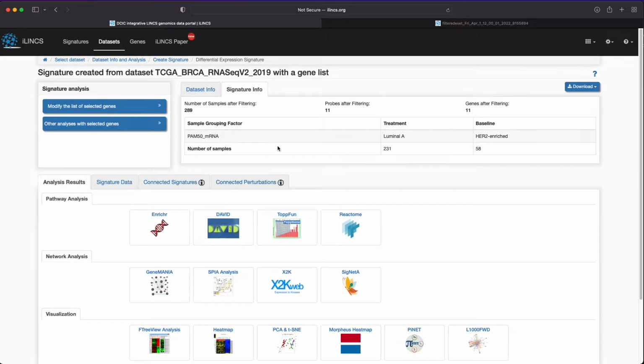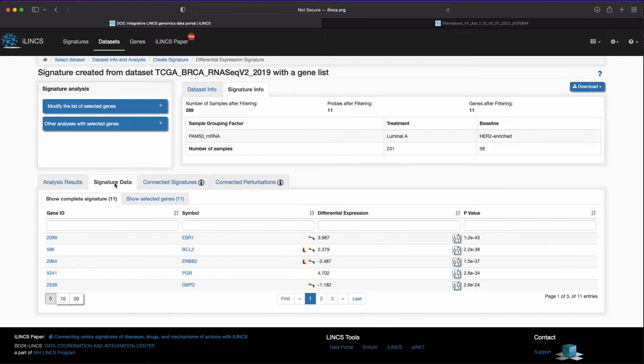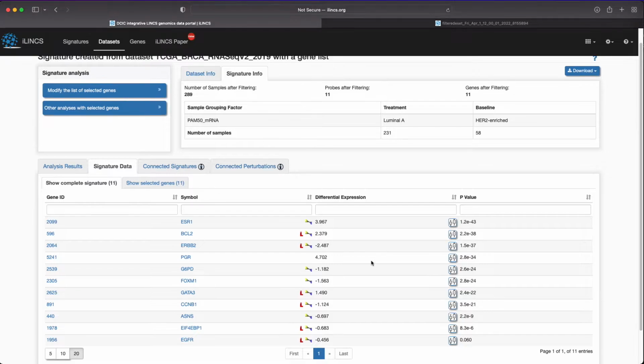The results page looks the same, and again the analysis was performed only for 11 genes corresponding to the 12 different protein probes, which we identified in the initial proteomics analysis.